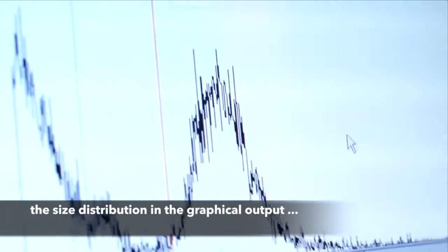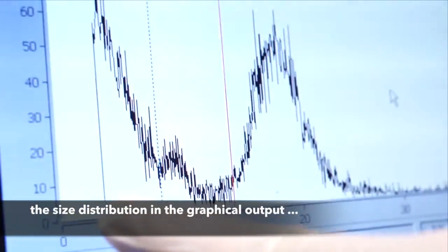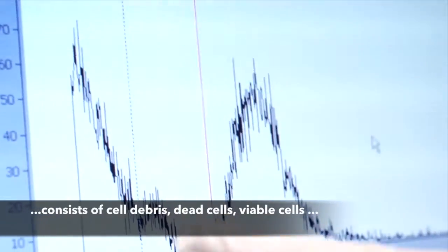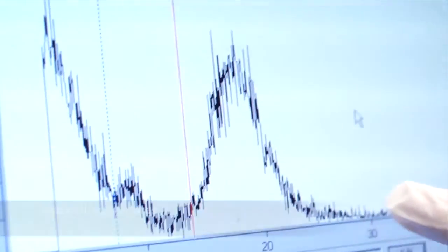In the graphical output, a typical size distribution is clearly visible, consisting of cell debris, dead cells, viable cells and cell aggregates.